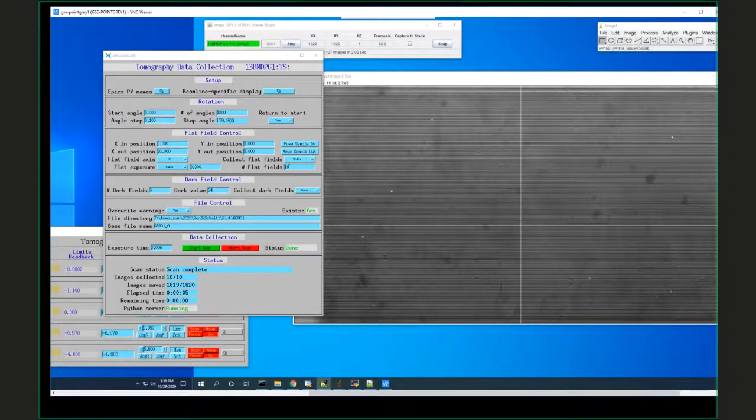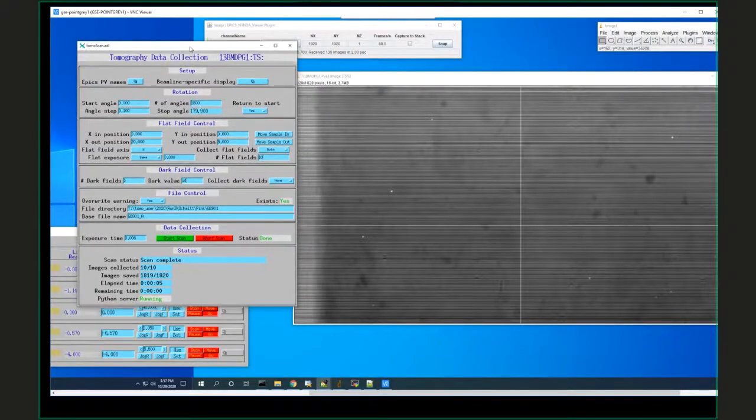But I definitely have to let the thing warm up with the right size beam for 10 minutes before I start collecting data. And I don't know if other scintillators have that problem or not. Thank you. Yep. Okay, so I think we've got two data sets now.